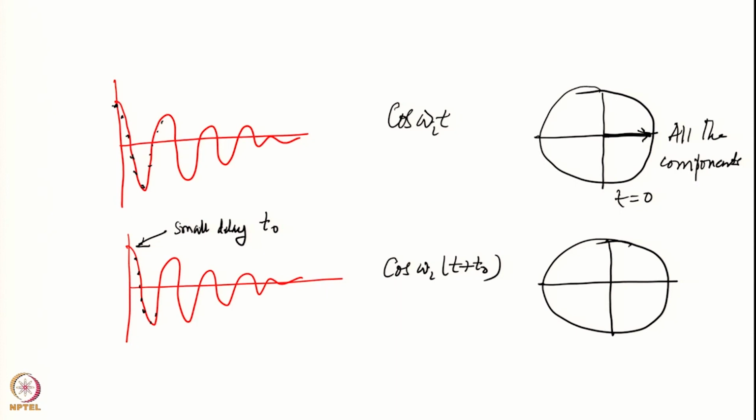I started collecting when the different components have moved to different extents. So let us say one component has moved here, another component here, and the third component here. These are different spins, different lines in your spectrum. They all have moved to different extents, let us call these 1, 2, 3, and all of these now have different thetas, right.